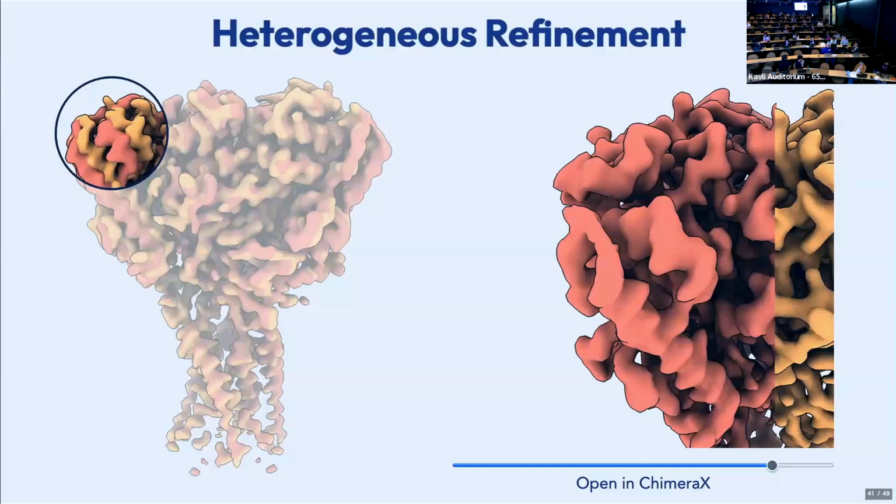I find the junk map actually interesting, because if you refine your junk map again, if you have time, I encourage you to do that, you may squeeze out something really different. And I'm thinking about it from a mechanistic point of view: it's really not just looking at the local region, but all the allosteric interactions and so on. That's equally important, particularly if you do drug design.